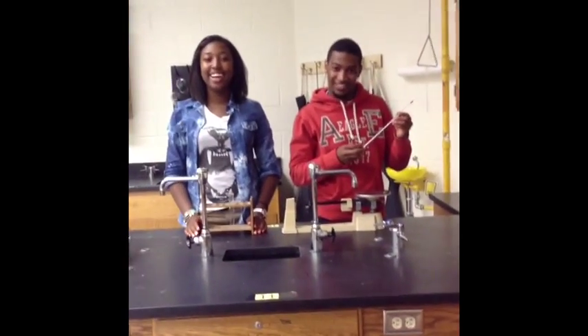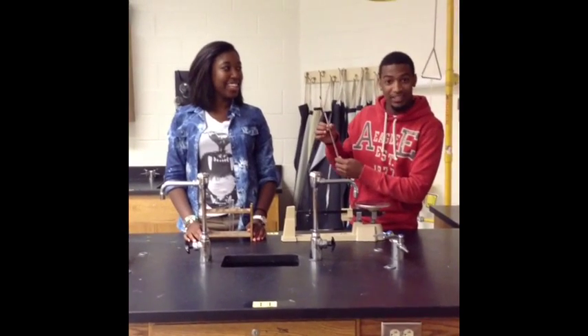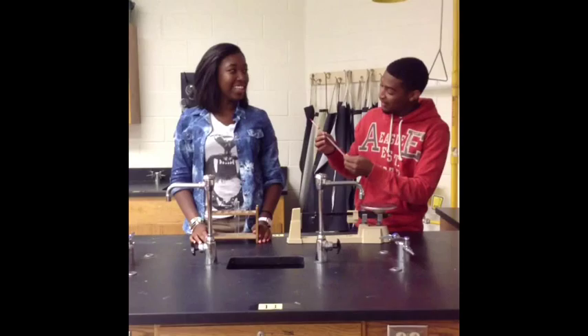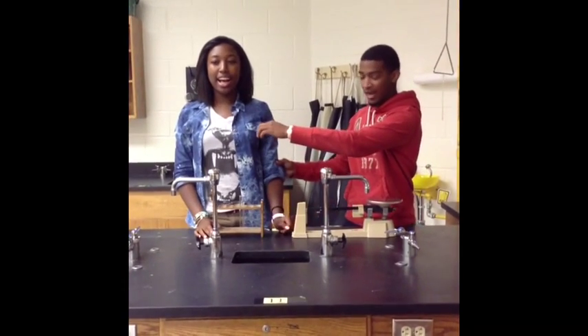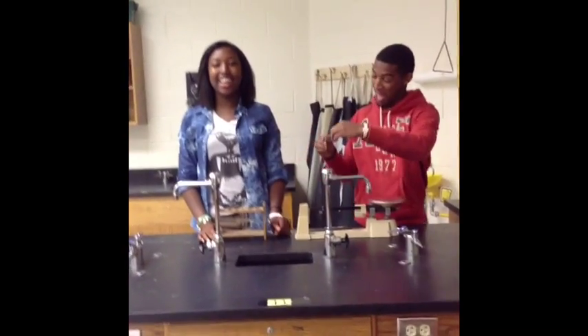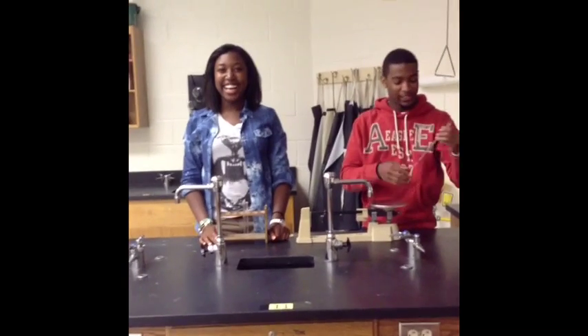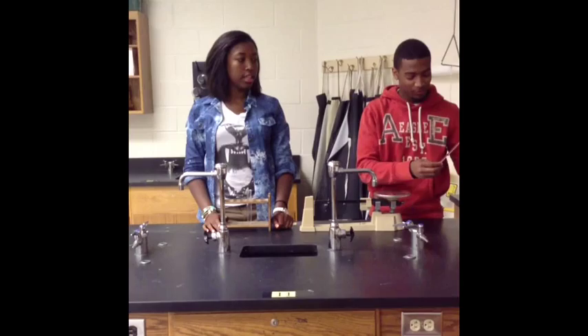This is a thermometer. This particular thermometer measures in Celsius. You can use it for many different things — for high temperatures or for cold temperatures, it doesn't matter. And you'll see the red line in there fluctuate.